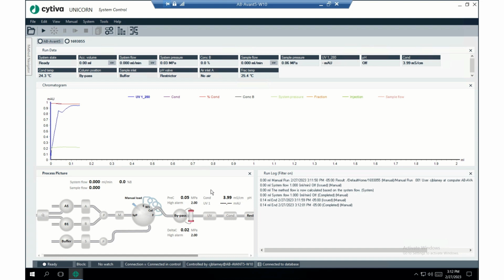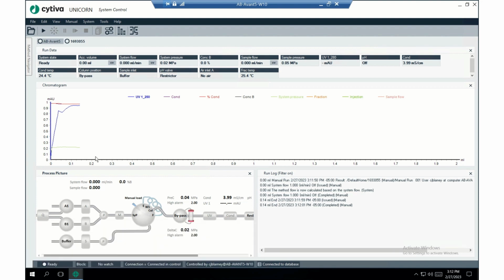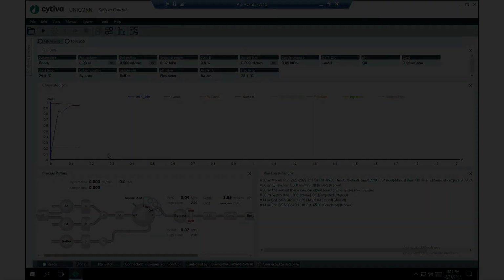In order to be able to start this ion exchange method, the first thing we're going to want to do is find the systems control module. I'm showing you this basically because I'm considering this an introductory video. You go down here to the Unicorn button, and then we're going to select the submodule that's got the C on it. This is what the systems control module looks like.